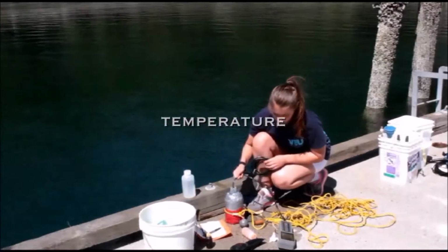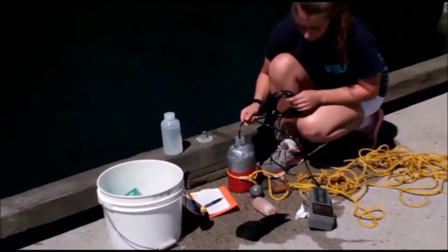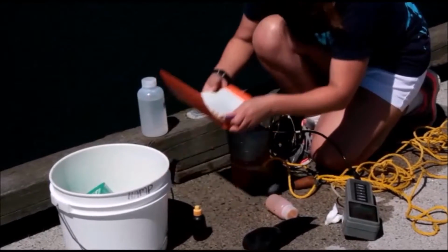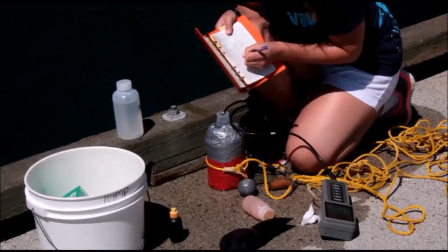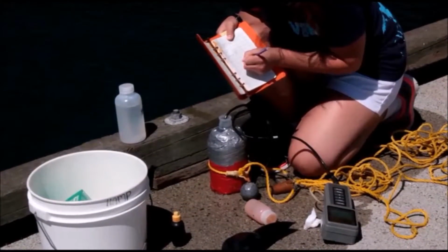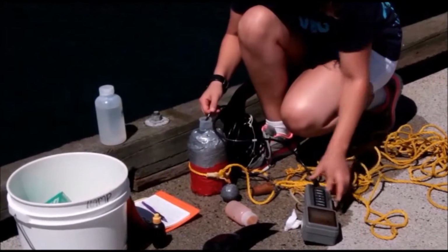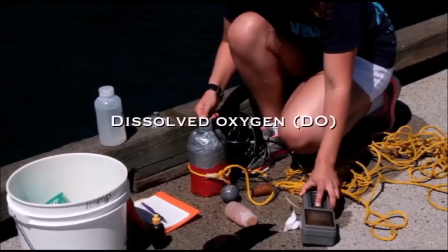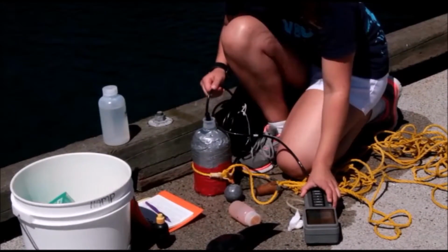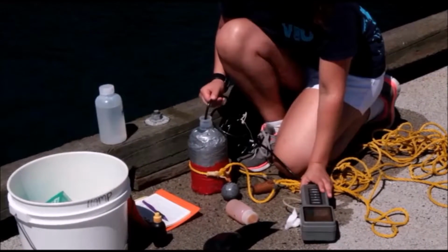So the multimeter probe, if you've got a bottle with a wide enough opening, the multimeter probe will flip right in and measure temperature and DO in the bottle. DO measurement usually takes a little bit longer to equilibrate. But when the measurement's stable, then you can mark that down.